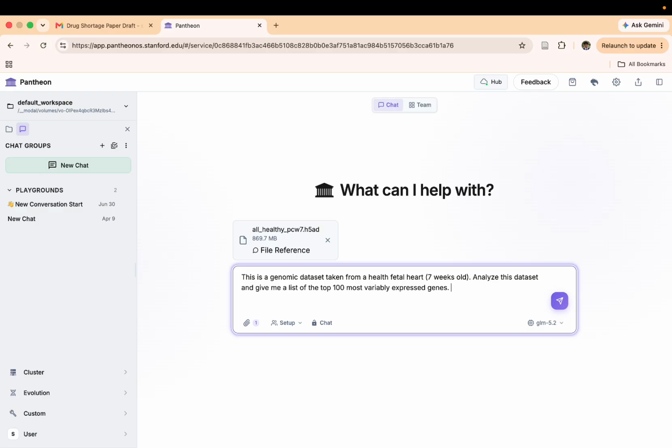Okay, so this is a relatively simple prompt. You can make your prompts as general as you want. I mean, this is pretty general. You can make it as specific as you want. You can also make the prompts a lot more complex.